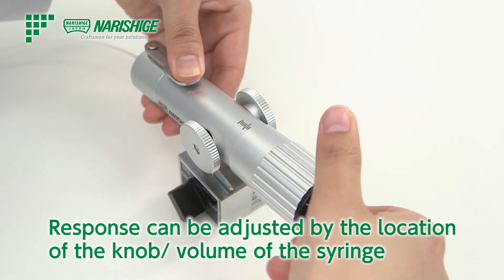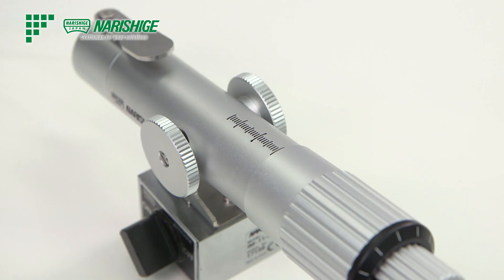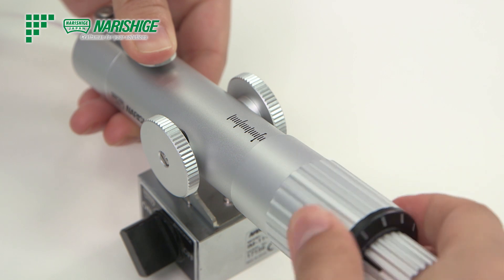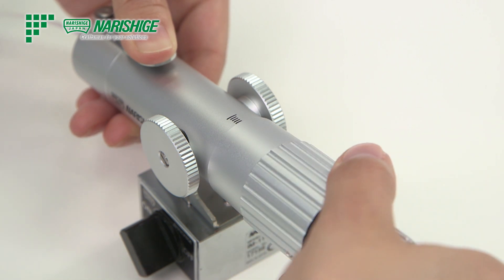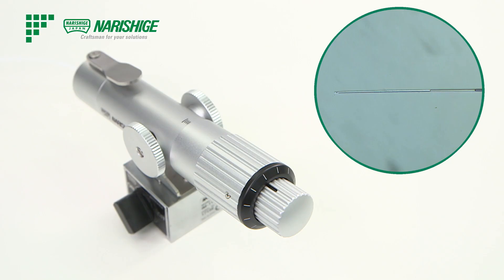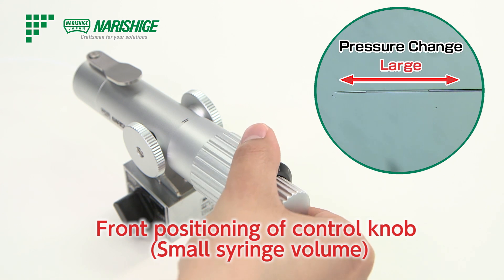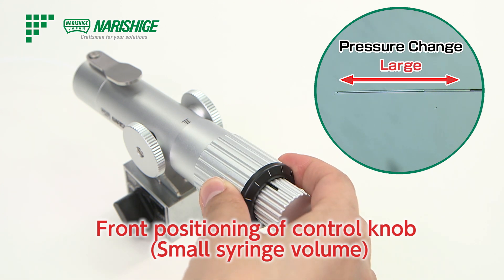When changing the syringe volume, press the pressure relief valve and move the control knob to adjust the size for the most appropriate response. When it is closer to the front of the body, the syringe volume is smaller and the compression rate is higher, which makes for a quicker response.